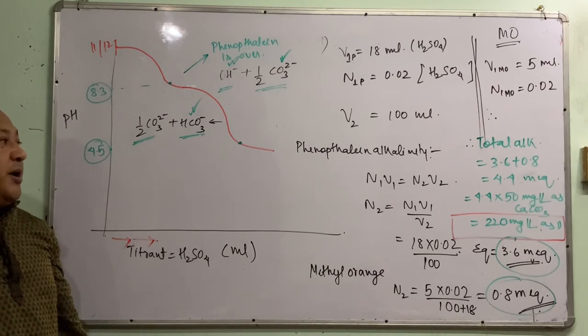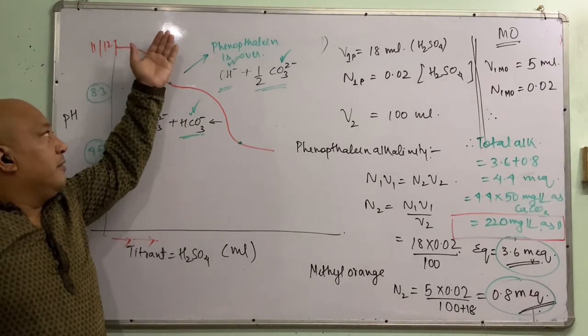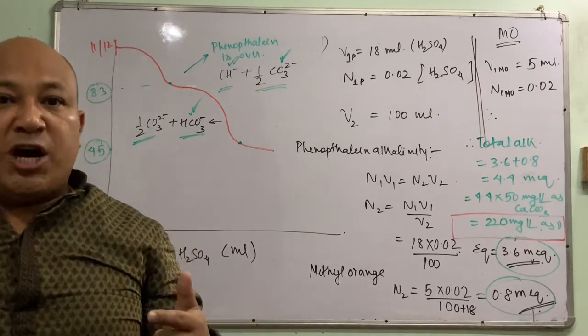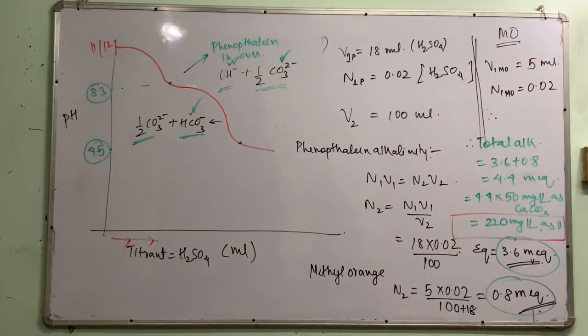Now, from here, how are we supposed to find the hydroxide, the carbonates, and the bicarbonates? That's going to come into the picture. You look at this chart very properly, okay? Let me check the video. Is it still on? Yeah, still on.